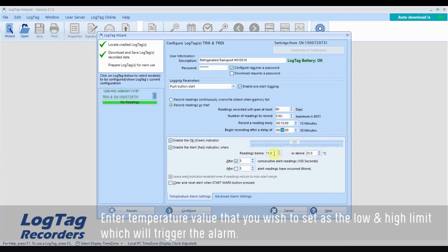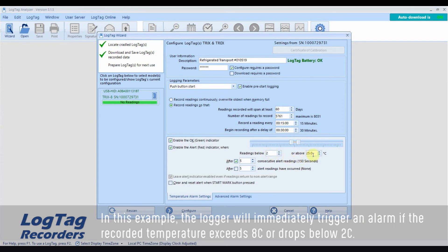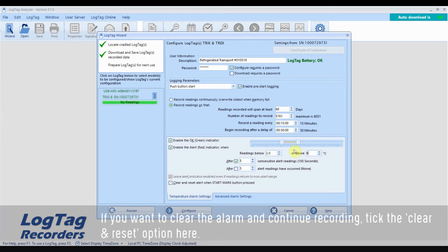Enter temperature values that you wish to set as the low and high limits which will trigger the alarm. In this example, the logger will immediately trigger an alarm if the recorded temperature exceeds 8 degrees Celsius or drops below 2 degrees Celsius. If you want to clear the alarm and continue recording, tick the Clear and Reset option here.